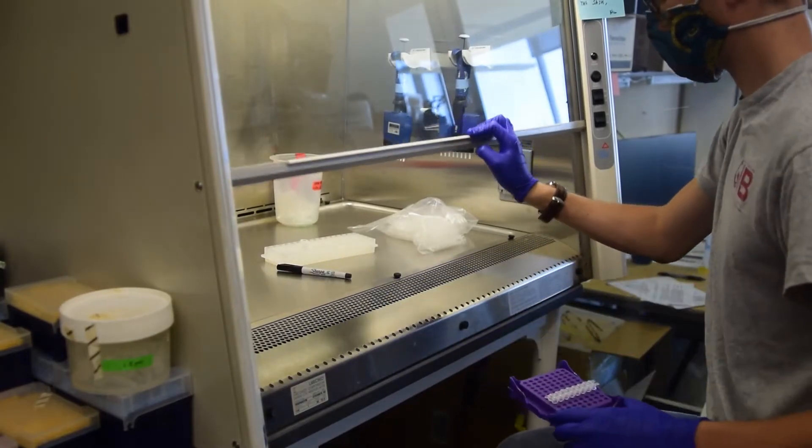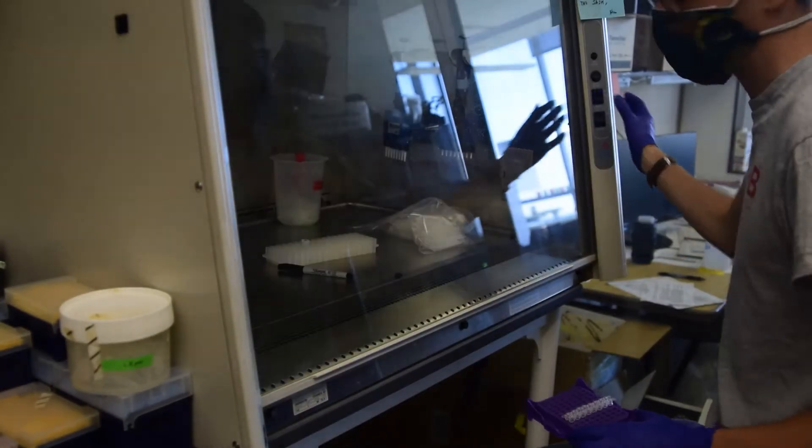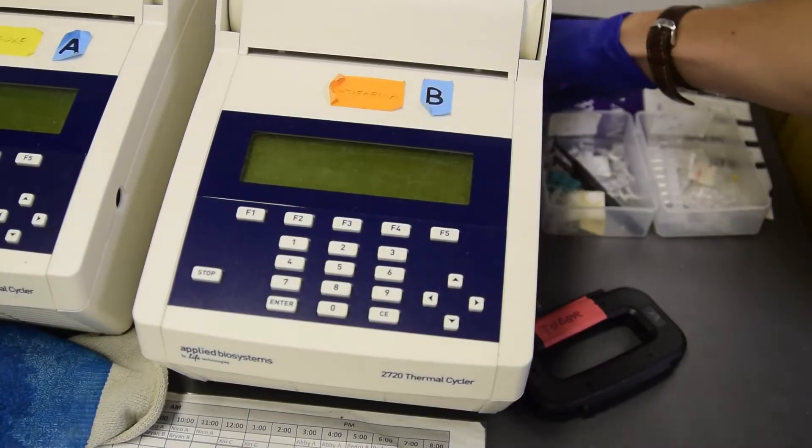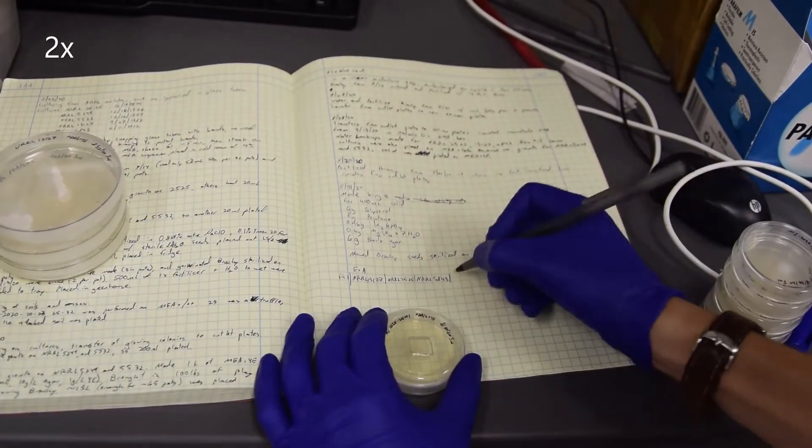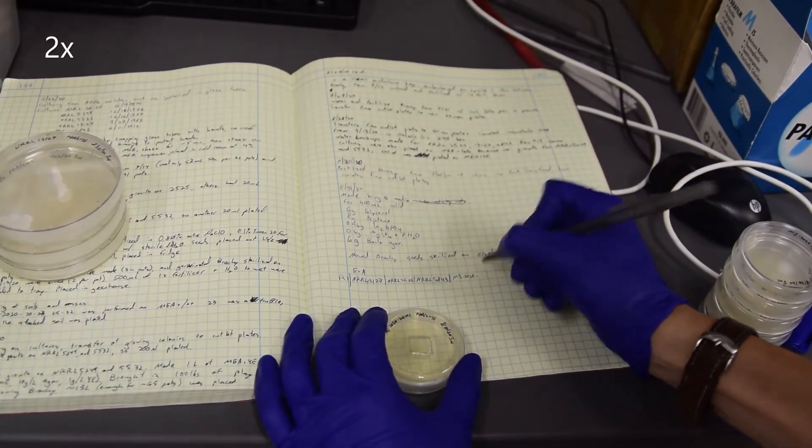Remove the filled strips and close the hood. You can clean this up while samples are on the thermocycler. Turn on the thermocycler so it is warmed up. Make a sample map in your notebook which corresponds each extraction to a sample name.